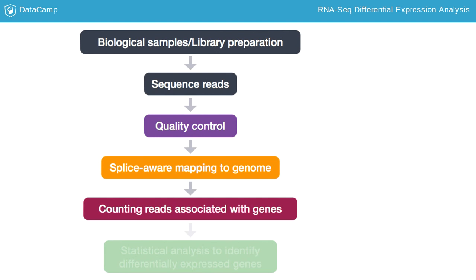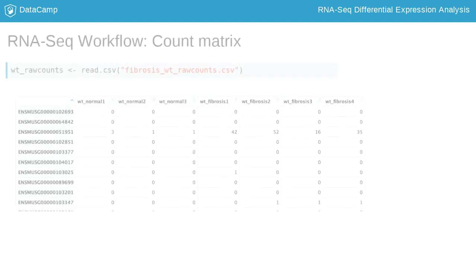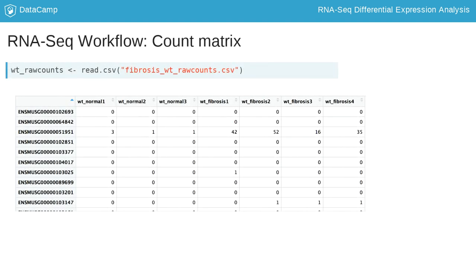Therefore, we will not perform these steps in the current course. This course will focus on the identification of differentially expressed genes using these count matrices as input. The analysis will be performed in R using predominantly Bioconductor packages. We can read into R the count matrix using the read.csv function, specifying the file. The gene count matrix is arranged with samples as columns and gene IDs as rows.